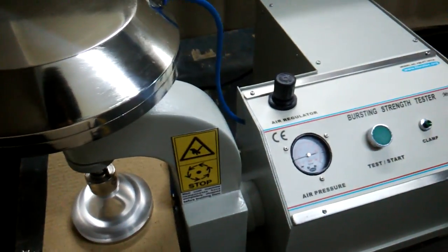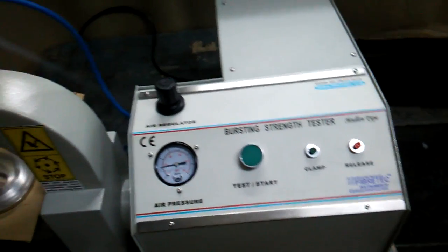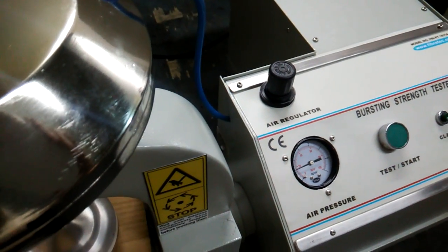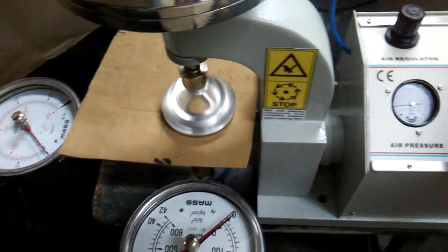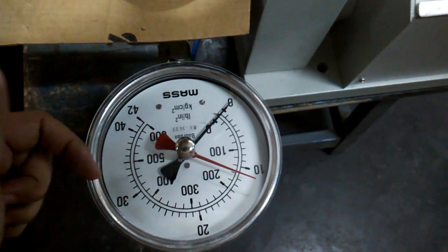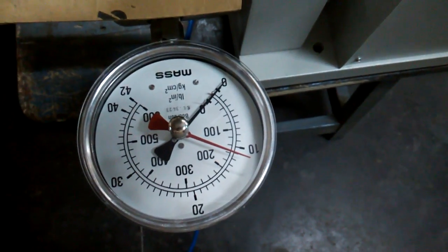We can calibrate the equipment using standard aluminum foils. For the corrugated sheet — like the cartons — we set it to zero, clamp it, and press the switch until the burst occurs. You can see it is 160 psi of pressure.